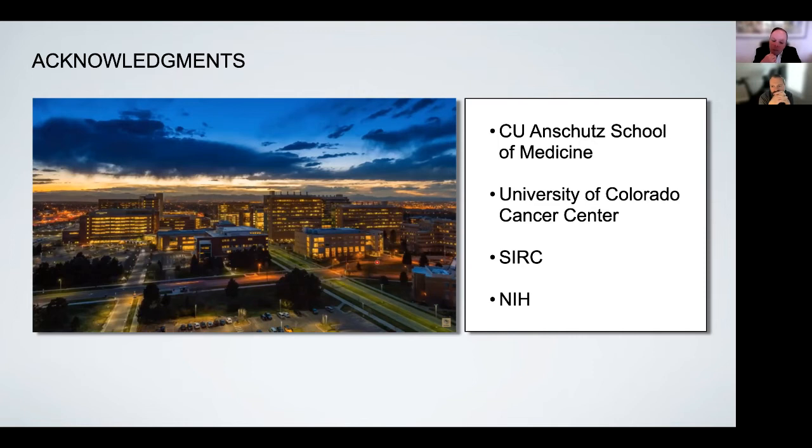That's correct. And it really is very specimen dependent. So I gave you the example of apoferritin from the class last fall. Literally, you can collect data in a couple of hours and do live processing while you're collecting data. And the next morning, you can have a structure at 3 angstroms, right? Or overnight, you could have a structure at 3.5 angstroms. If you are talking about something like the complexes that Jeff or Mamuka or I worked with, which are much larger, harder to purify, more dynamic, then you're talking about several days of data collection and very careful screening of the images and convoluted image processing, and then you're talking more weeks and months.